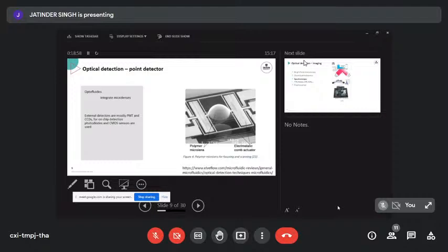Another nice thing is, because we're microfabricating in transparent materials, we can actually make it kind of a dome shape as well. We can fabricate our lenses at the same time as we fabricate our devices. A little bit harder than you think it would be initially, but there's been some really nice successes.